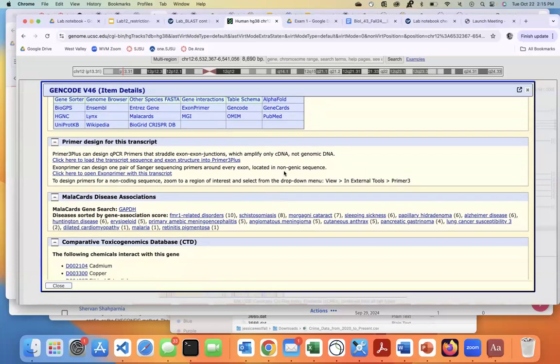If you want to design primers, we're not going to design primers in this class, unfortunately, but go back to how we were talking about how we can use restriction enzymes to do different digests and stuff like that. This is where you could produce the primer. Or if you want to amplify, let's say you have that piece of gene and you want to amplify it to use downstream for cloning or whatever, you can use primer design to isolate it out of the human genome.